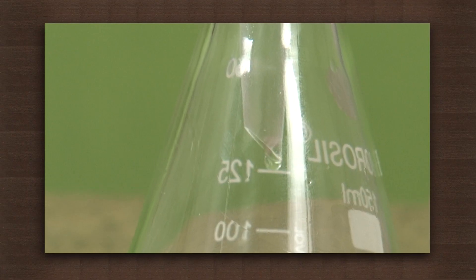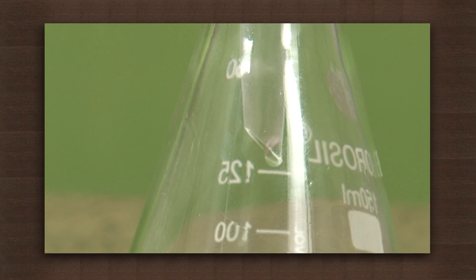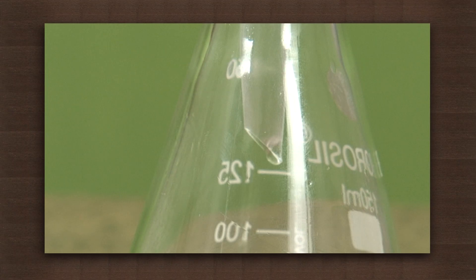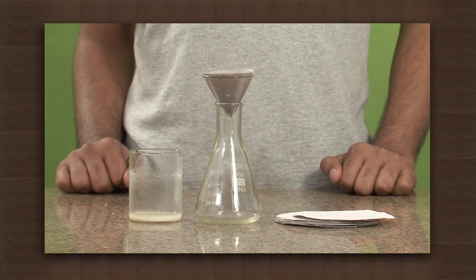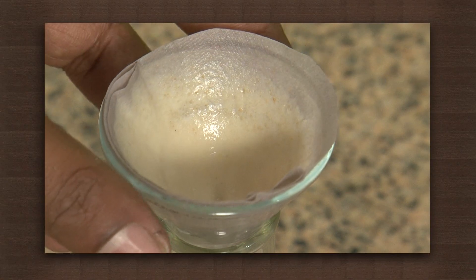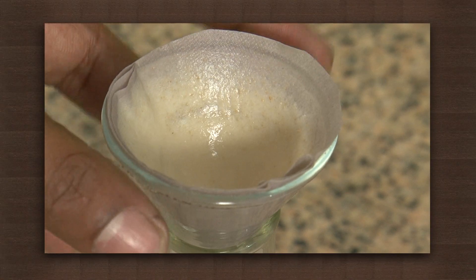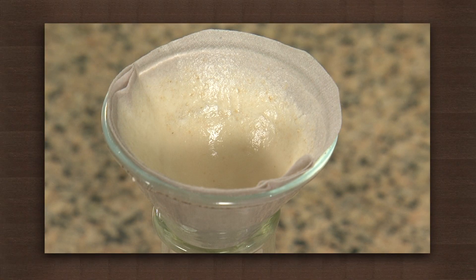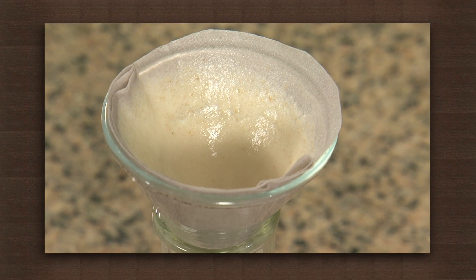Clear water passes through the filter paper and gets collected in the conical flask. The wheat flour particles cannot pass through the filter paper and remain on the filter. This is because the pores of the filter paper are smaller than the particles of wheat flour.